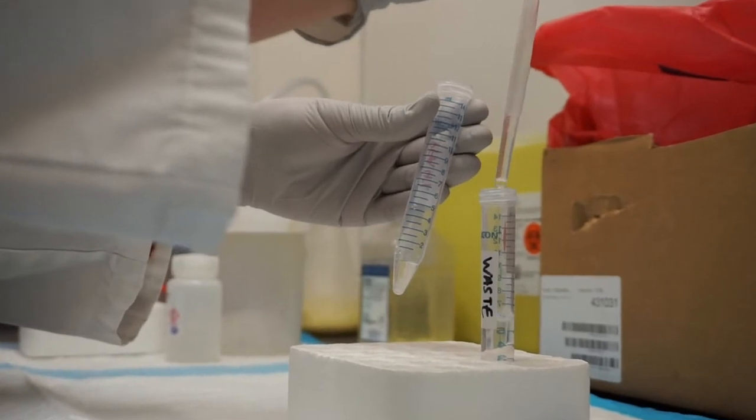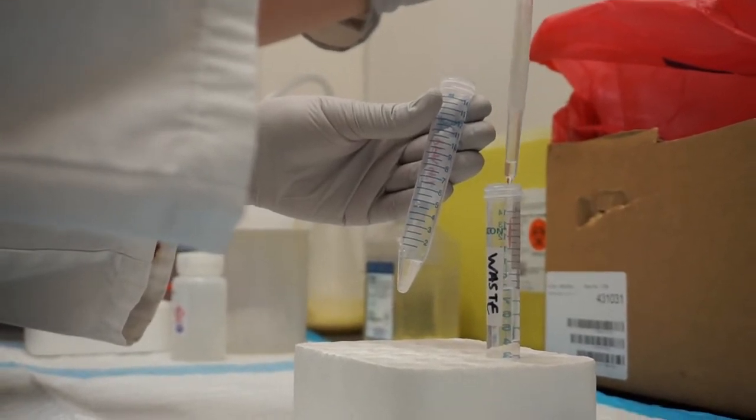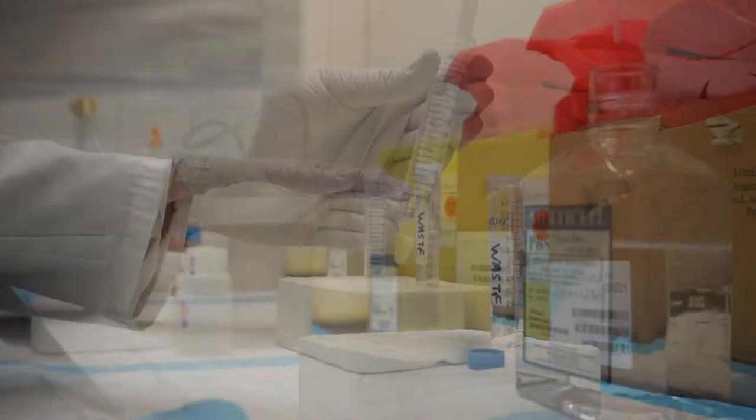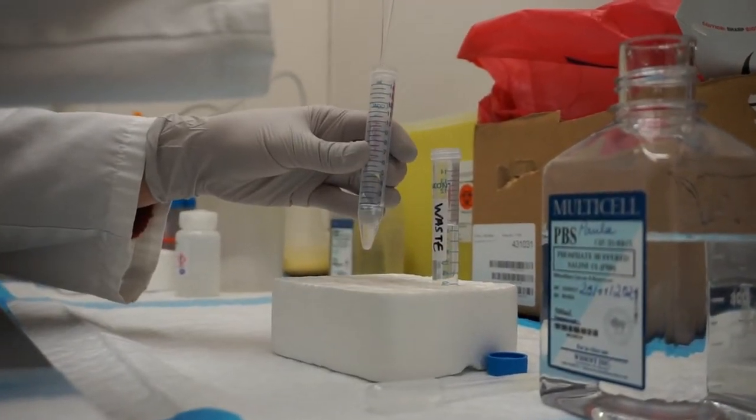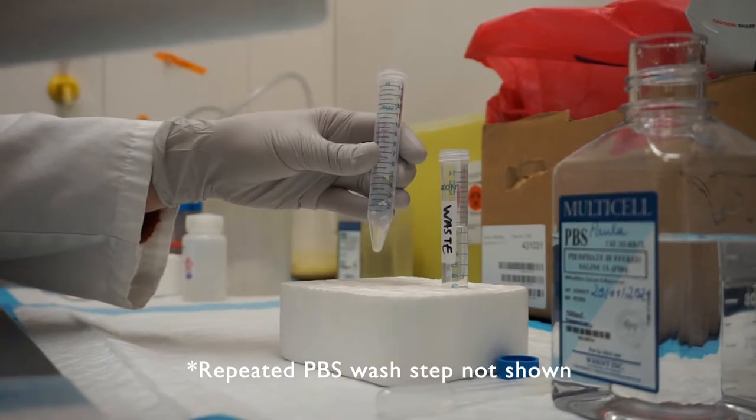Once the samples are fixed, remove the paraformaldehyde solution. Then wash the organoids with PBS for 15 minutes. Repeat the wash step twice.